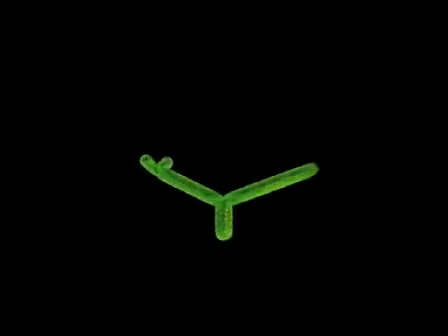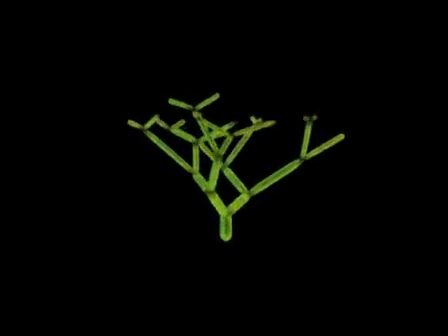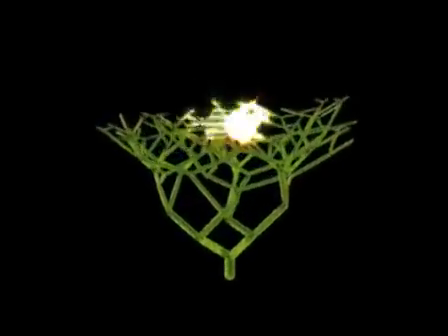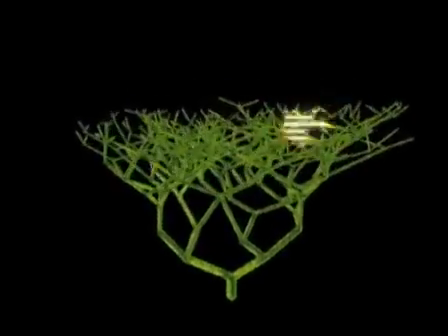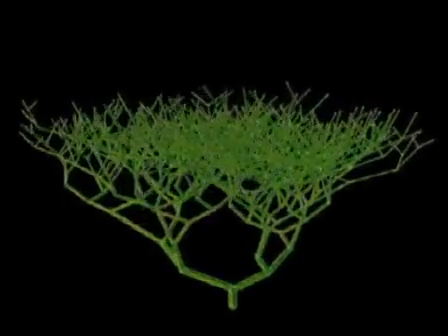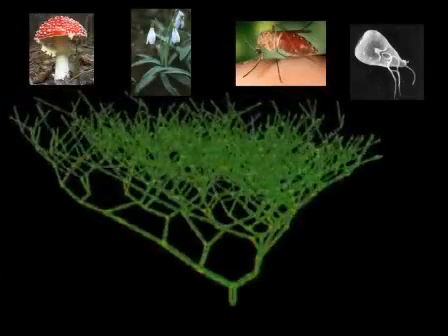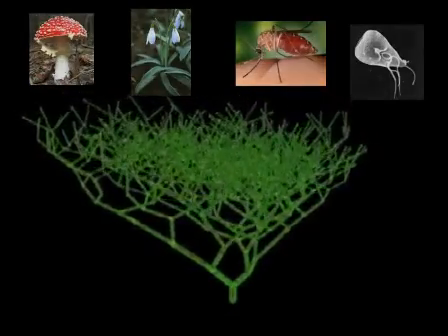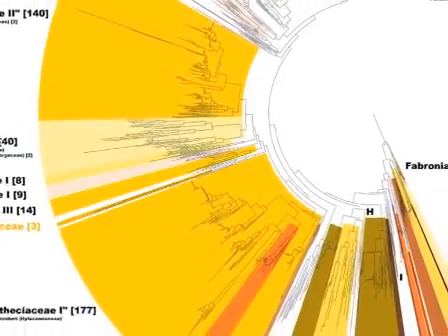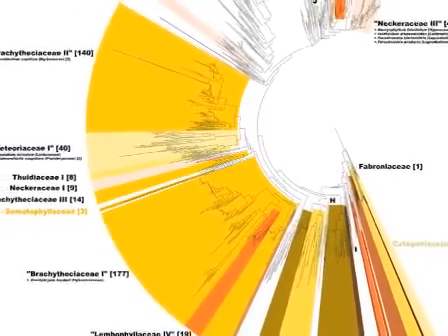Secondary structure analysis extends the taxonomic applicability of this marker. Whereas the rapidly evolving and therefore very variable ITS2 sequence is mainly suited for phylogenetic analysis at species level or lower, adding structural information permits analysis at higher taxonomic ranks simultaneously, due to the strongly conserved ITS2 secondary structure consisting of its 4 characteristical helices. Thus, the results from secondary structure analysis can improve the phylogenetic resolution obtained from the primary sequence.